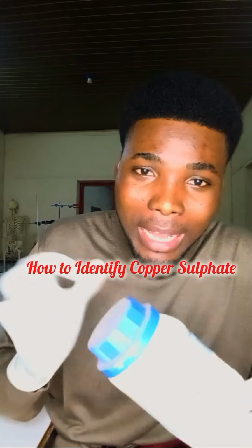This salt that I hold in my hand is copper sulfate. Now, in case you are wondering how they used to know, how did I know that this thing is copper sulfate? Let me quickly explain it.